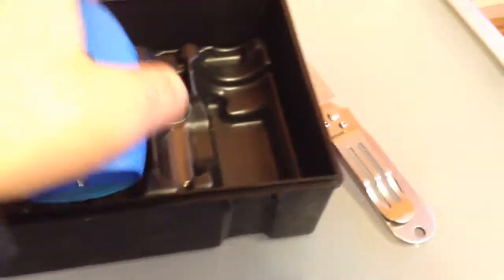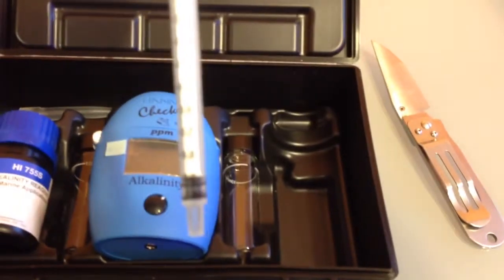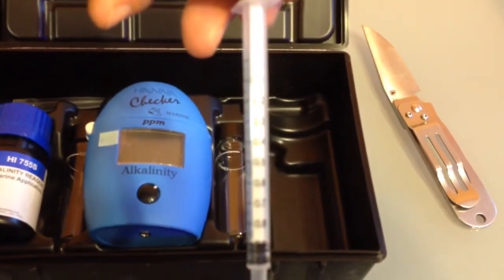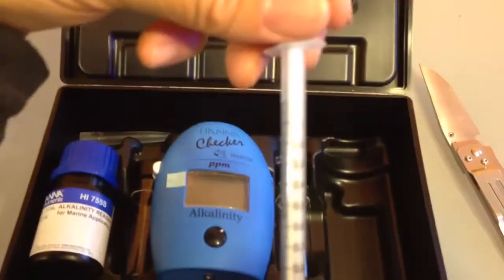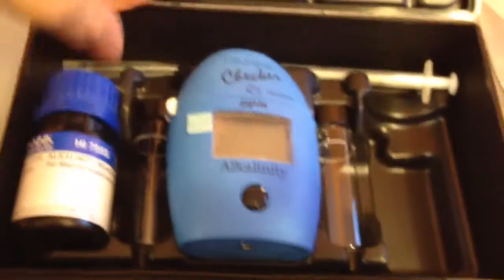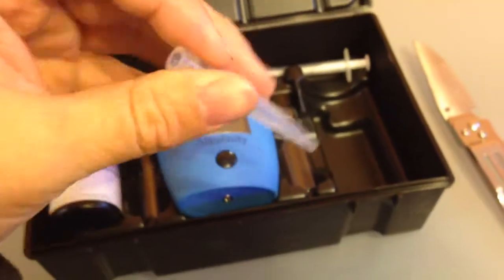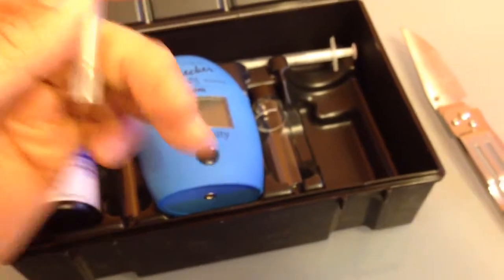The case is nice. Looks like something should go here. Anyway, we've got a one milliliter syringe — I've got a bunch of those so that doesn't really matter — and then kind of like a pipette top. I guess that's just for whatever.